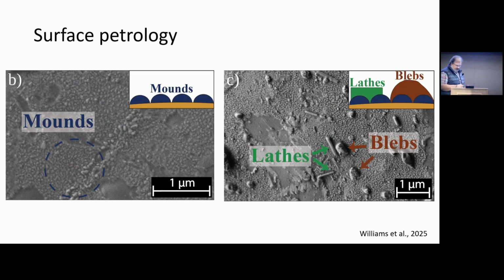So this is from Tom's paper. This is, again, a black glass bead from 74001. These are mounds, zinc sulfide mounds on top of the glass. These things had been seen in the 70s when the samples were first returned, but at that time the SEM and the technology is not nearly as good. And now we can see a whole larger array of phases sitting on the surface.